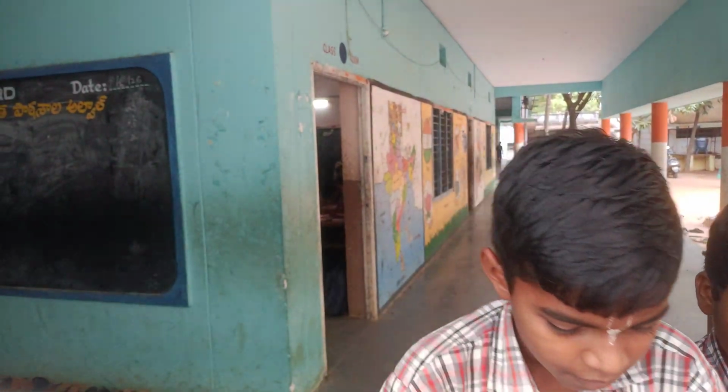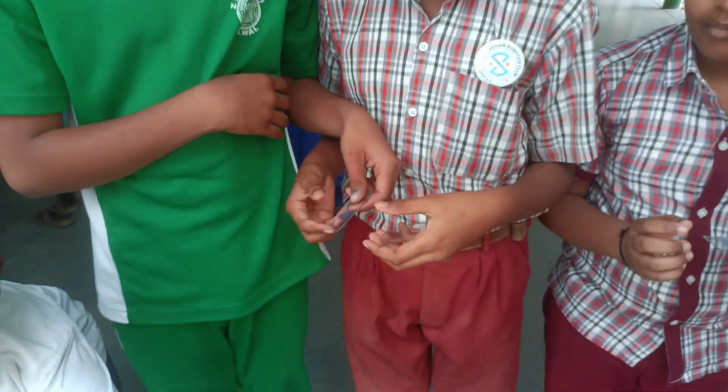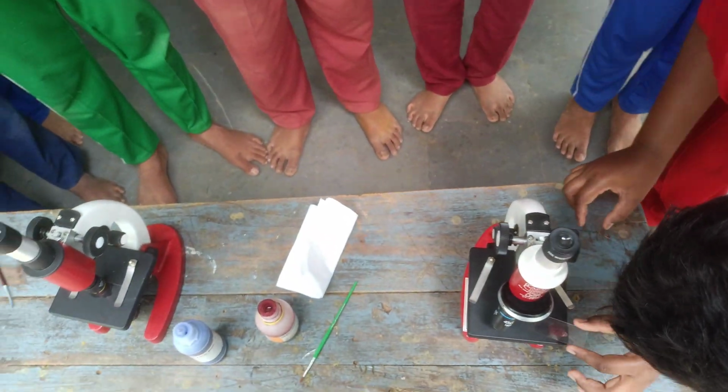Observing onion peeling. Observing cells in onion peels. Required materials: watch glass, slide, cover slip, microscope, brush.